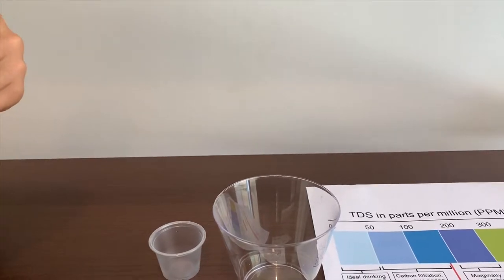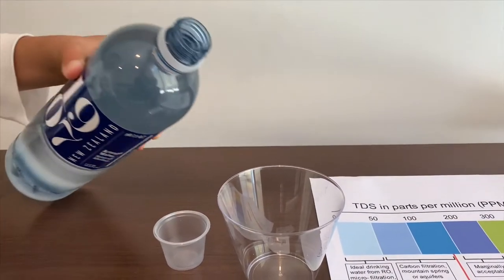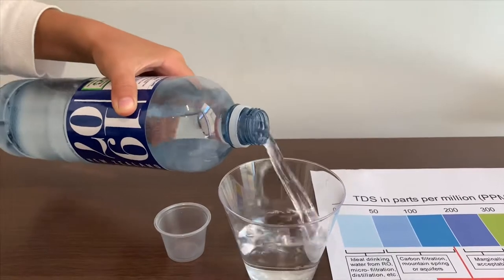First, we're going to test the TDS level. Then we are going to test the pH.